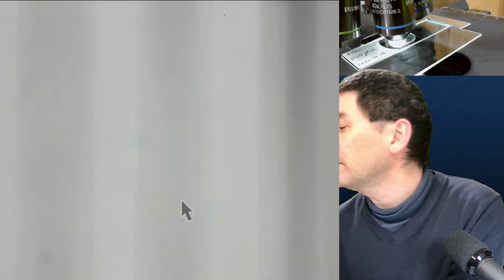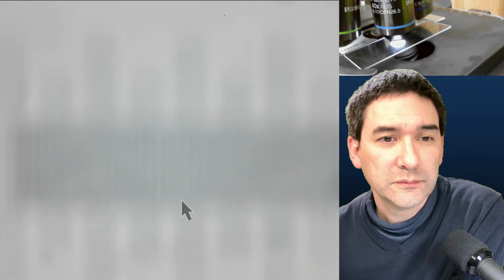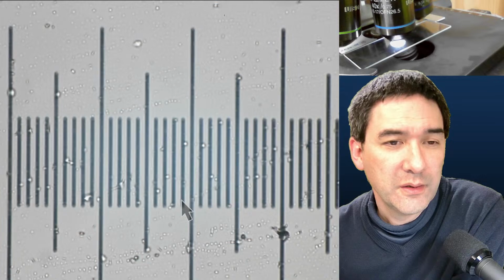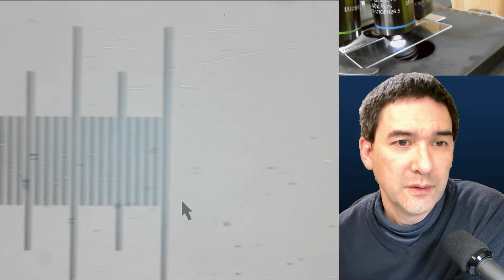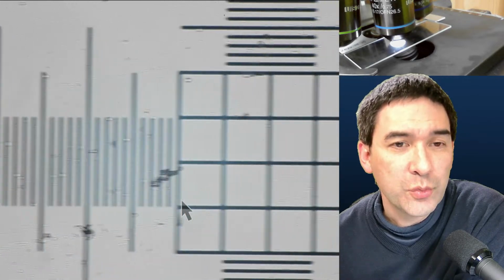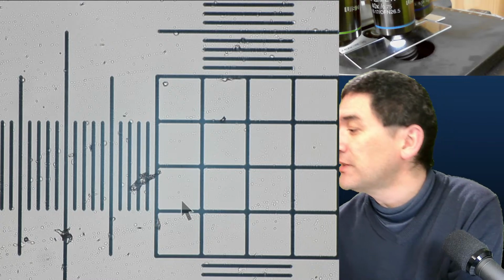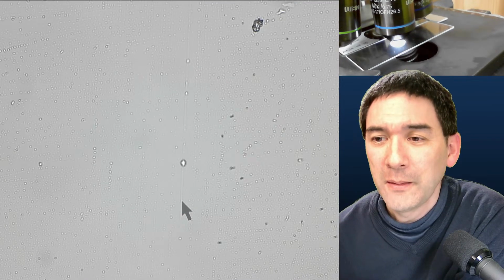Huh? Yeah, that's again the circle over here. Okay, and here we are again. There are also special slides around called hemocytometer slides, which allow you to actually count cells. So this was simply a little bit of a sidetracking here.